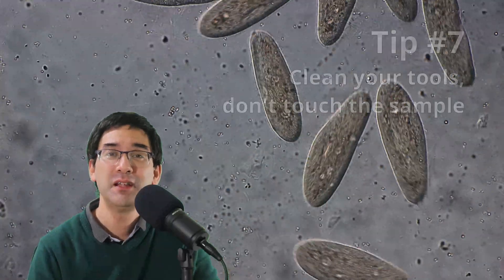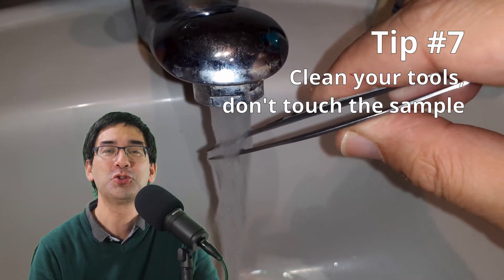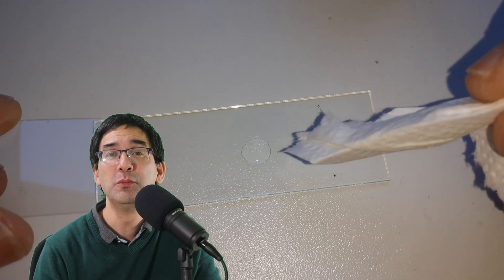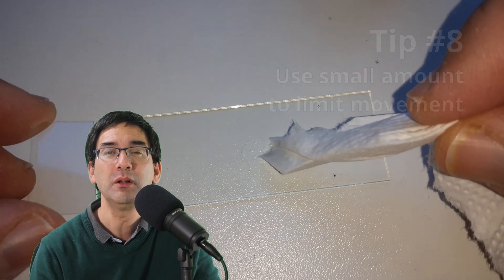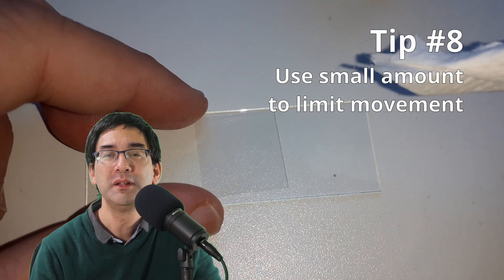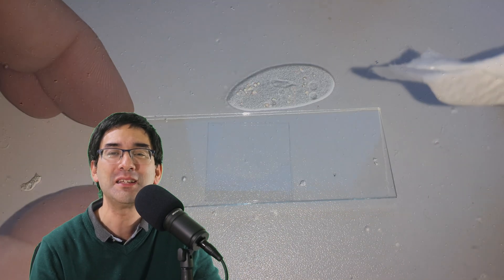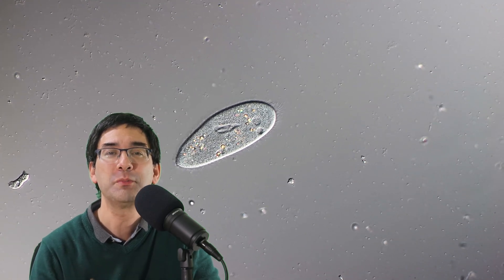Tip number seven: clean your tools, as there are bacteria on them, and you want to make sure everything is clean also for health reasons. Tip number eight: paramecia like to move around quite quickly, but if you use only a very small amount of water on the slide, the paramecia will be sandwiched between the cover glass and the glass slide, which limits their movement so they slow down significantly and you're able to observe them much better.